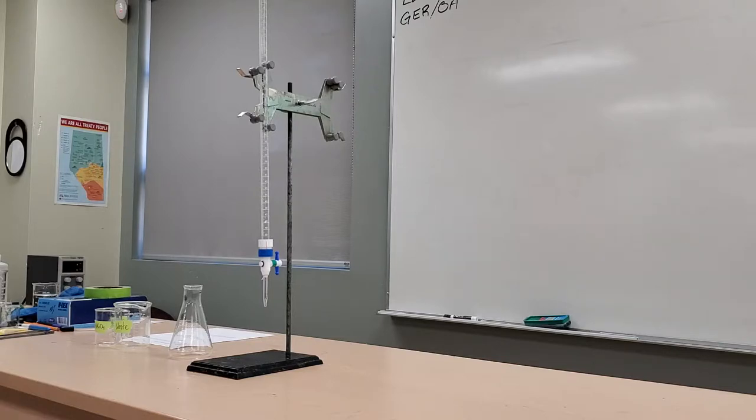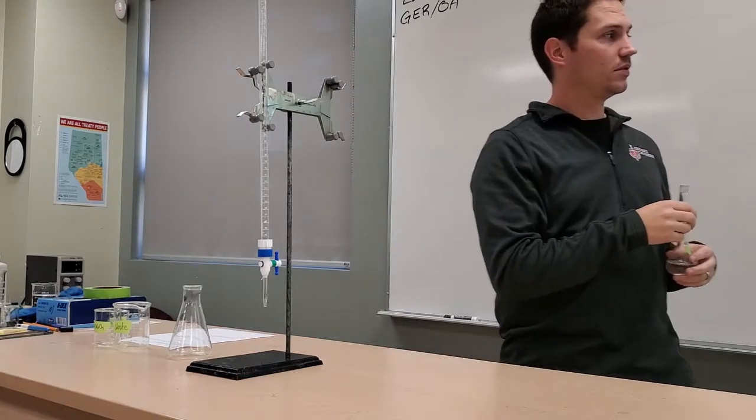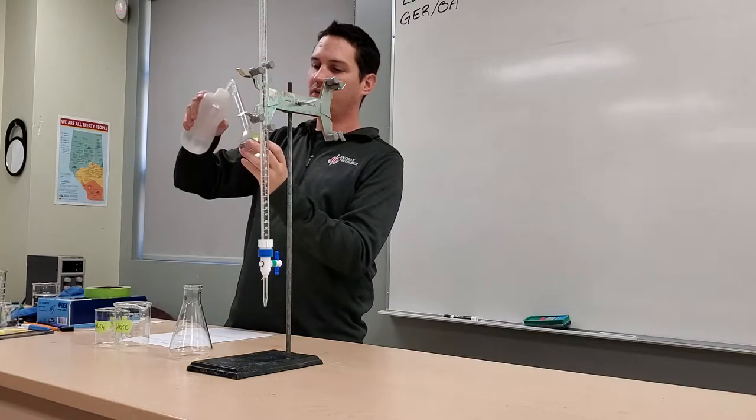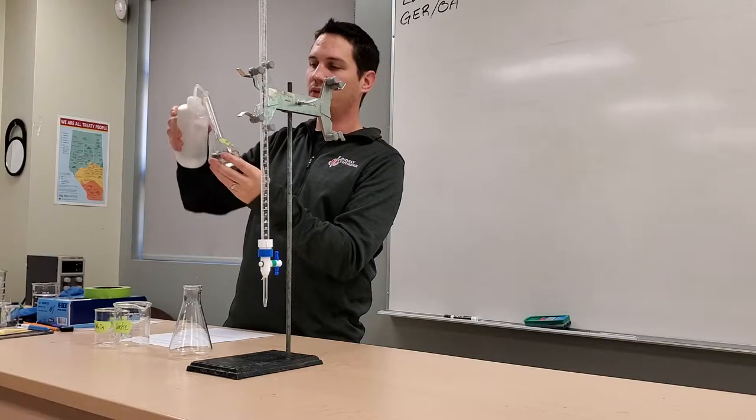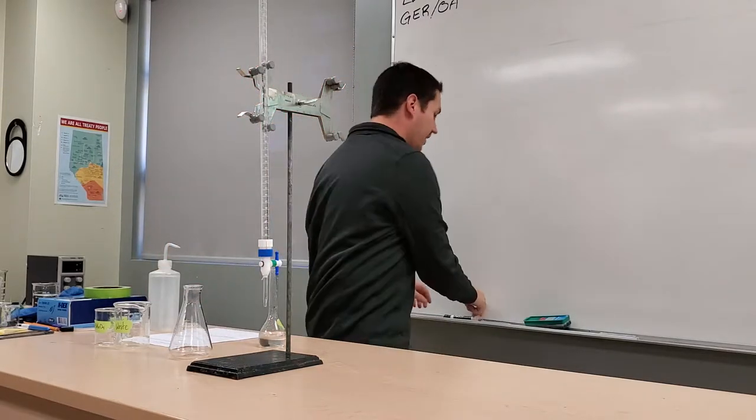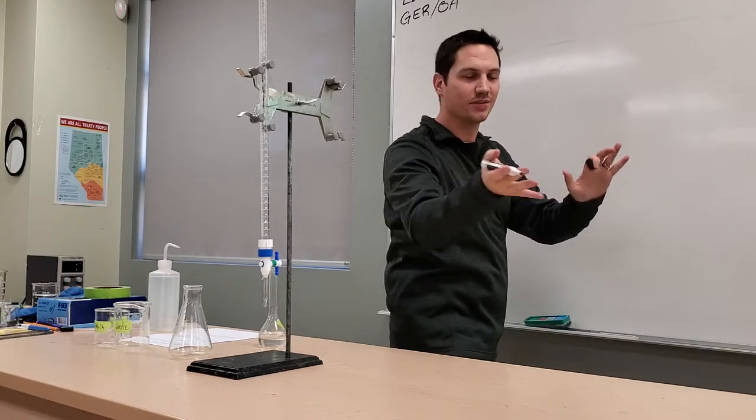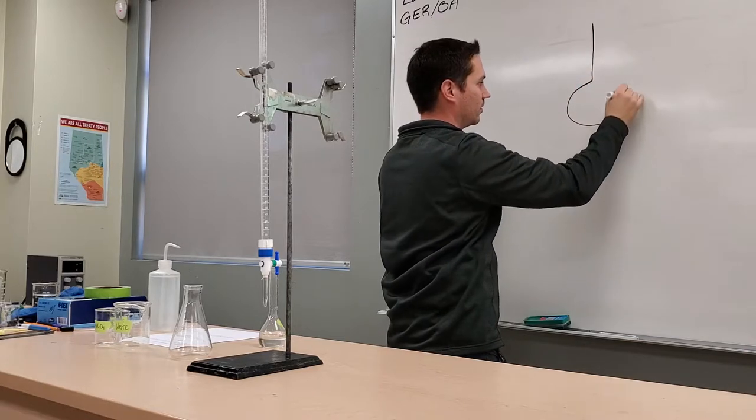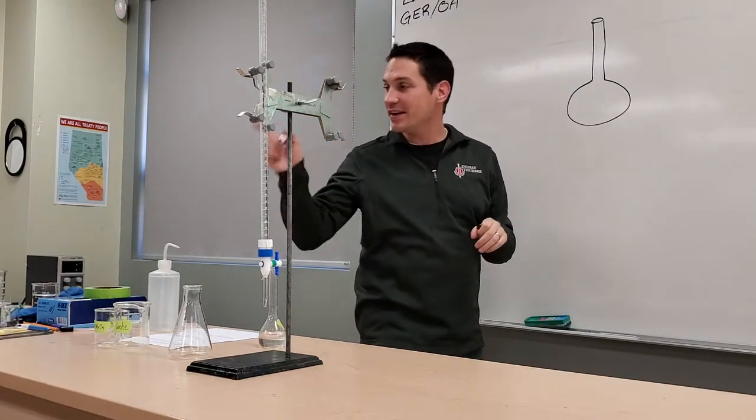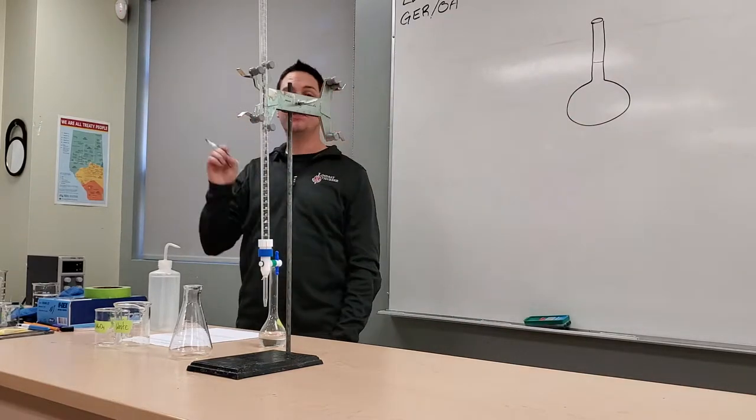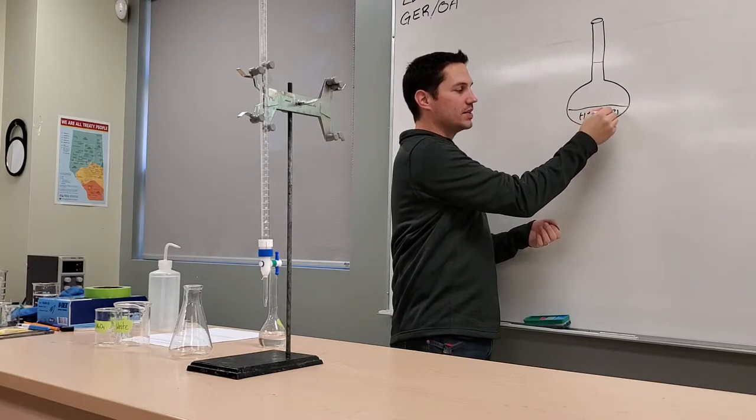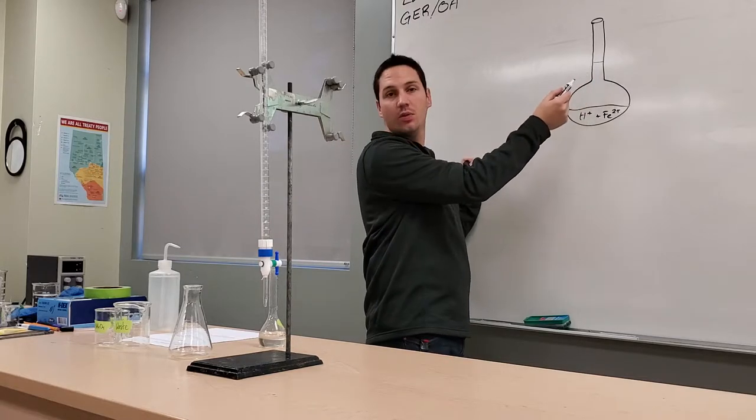Still make sure you add about 40 milliliters of acid, because you need excess acid for this titration to work out. So I dissolved all of my iron compound into 40 milliliters-ish of sulfuric acid. Then what do I have to do? Transfer the solution. Yeah, so I transferred it into the volumetric flask already. I kinda did it backwards, but it doesn't really matter. Just make sure your sulfuric acid and all your solid gets into the volumetric flask. Then what do you gotta do? You gotta add potassium. You gotta complete the preparation, so I gotta fill this up to 100, right?